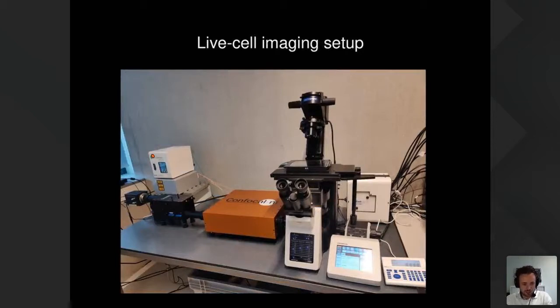For the live cell images I took, I used this microscope, which is an Olympus IX83. And we have a cool LED wide field illumination unit. Then on the left-hand side, you can see the RCM, the multi-split, and the camera. And above that, you can see a Tokai Hit stage-top incubation system, which fits all microscopes as well. And then we have a Toptica 4-channel laser combiner.